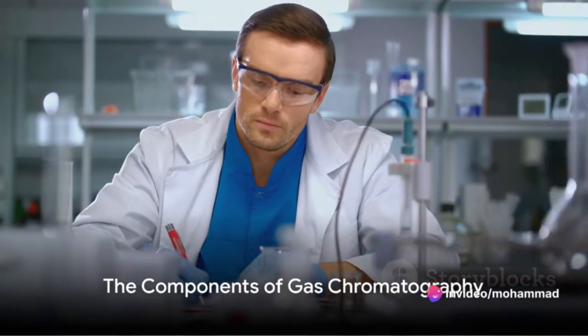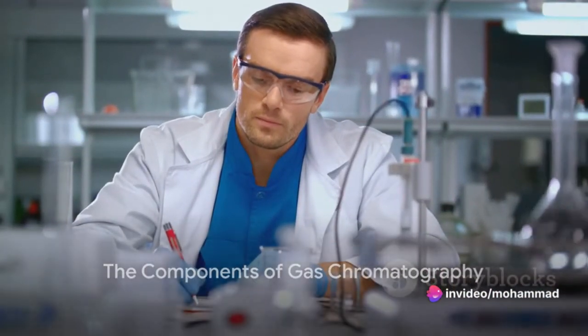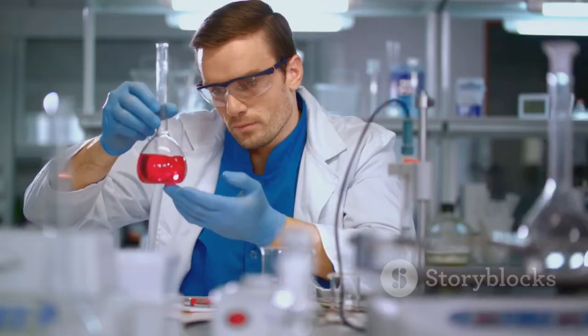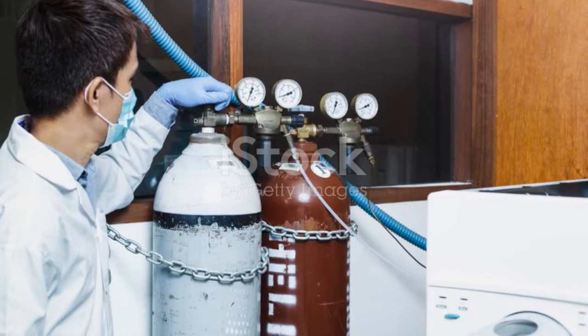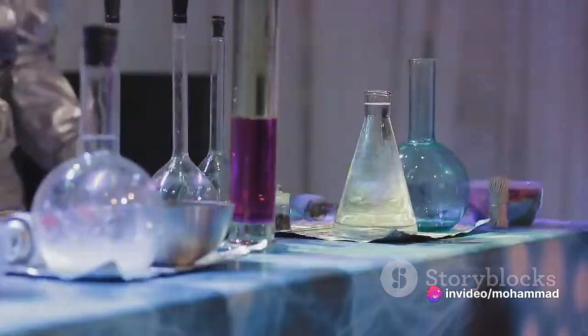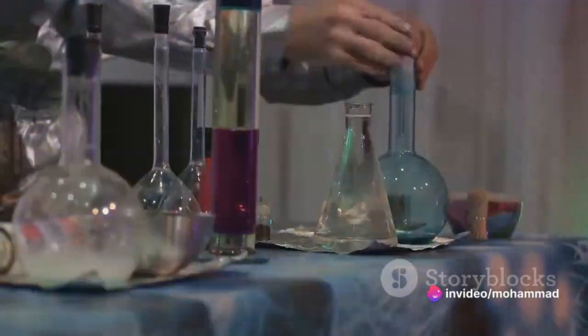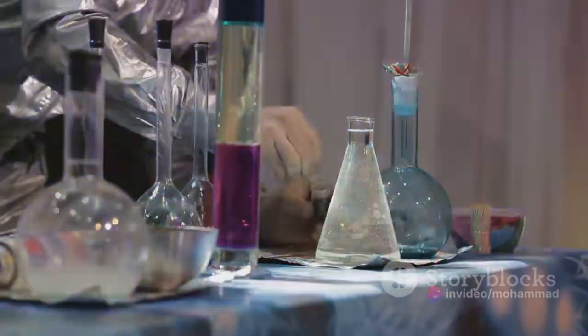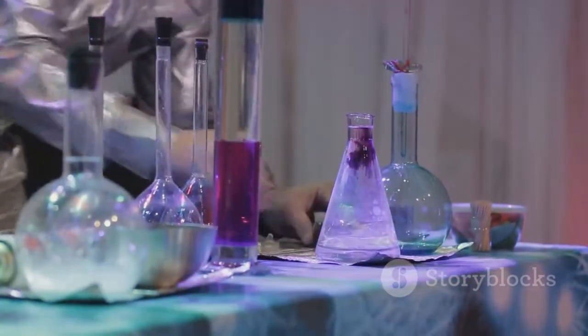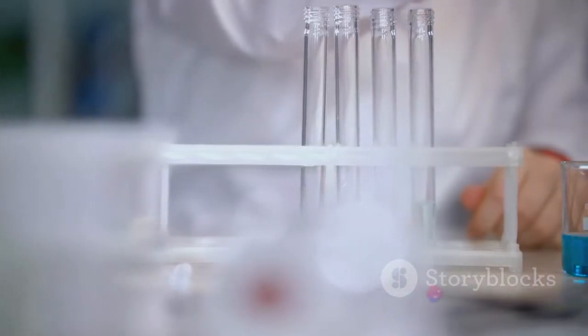Gas chromatography may sound complex, but it's composed of a few key parts. Picture it as a race with each component playing a unique role in the journey from start to finish. Firstly, we have the gas supply, acting as the carrier. This is our wind, pushing our competitors, or in this case, the molecules, onwards. The type of gas used often varies, but helium is a popular choice due to its inert nature.